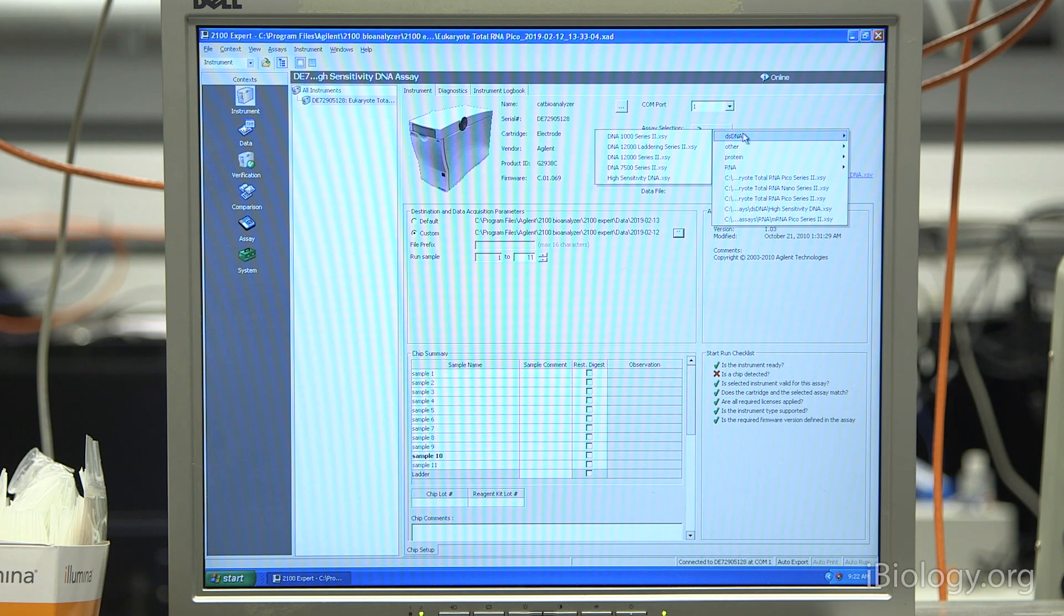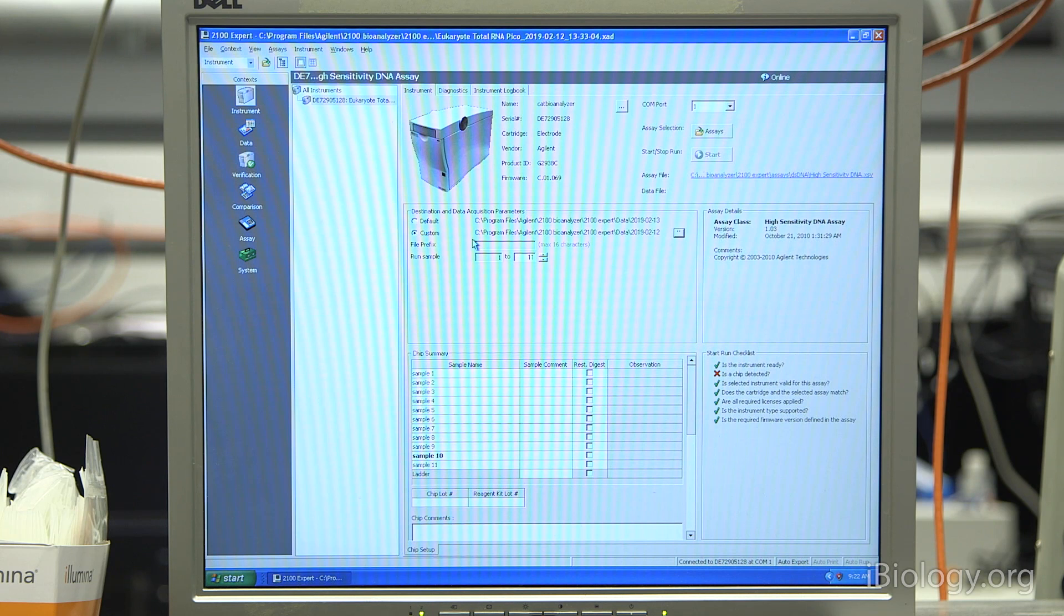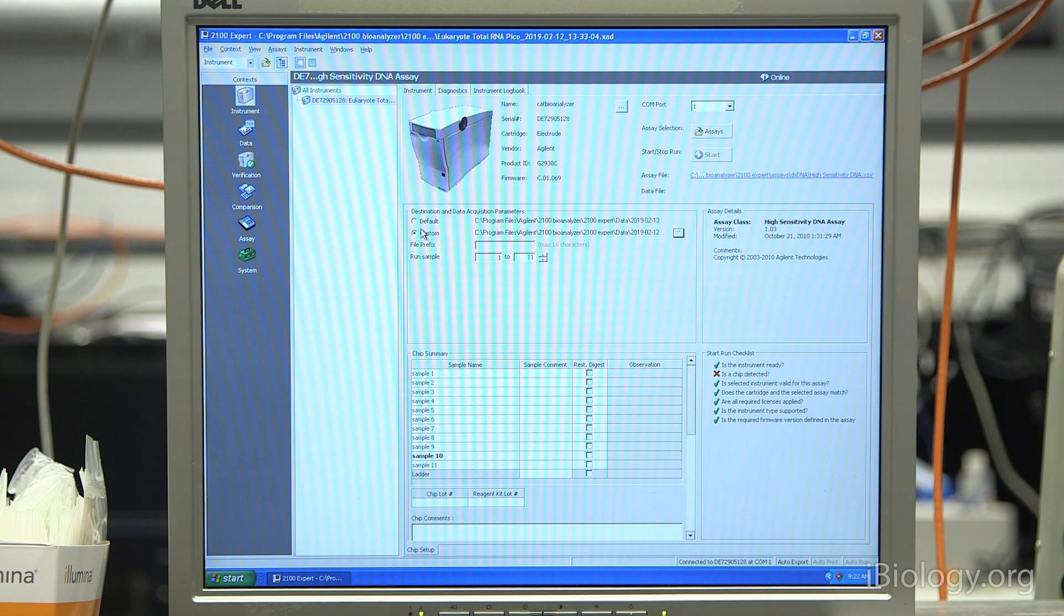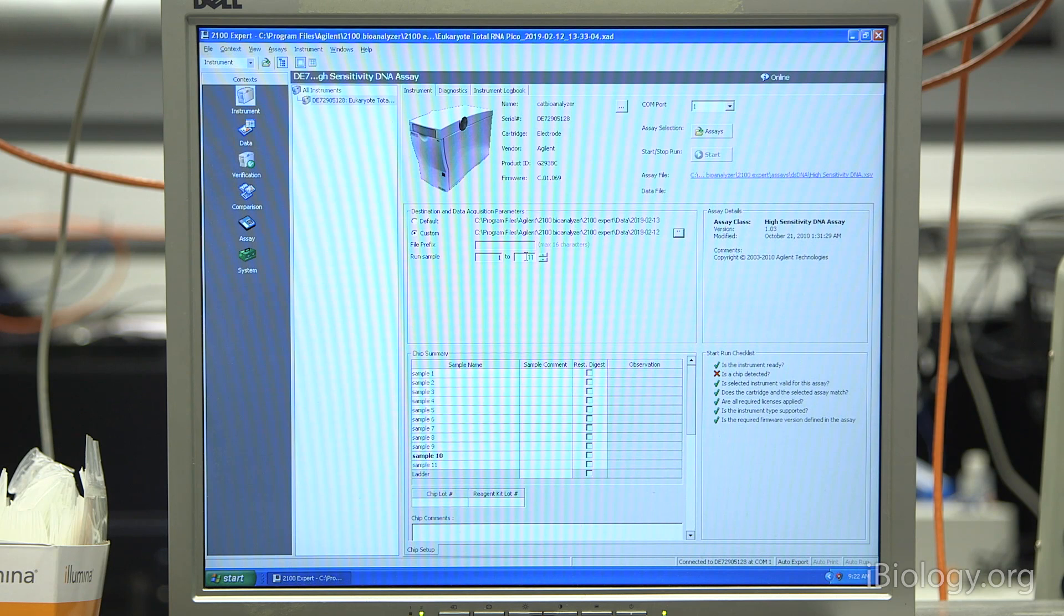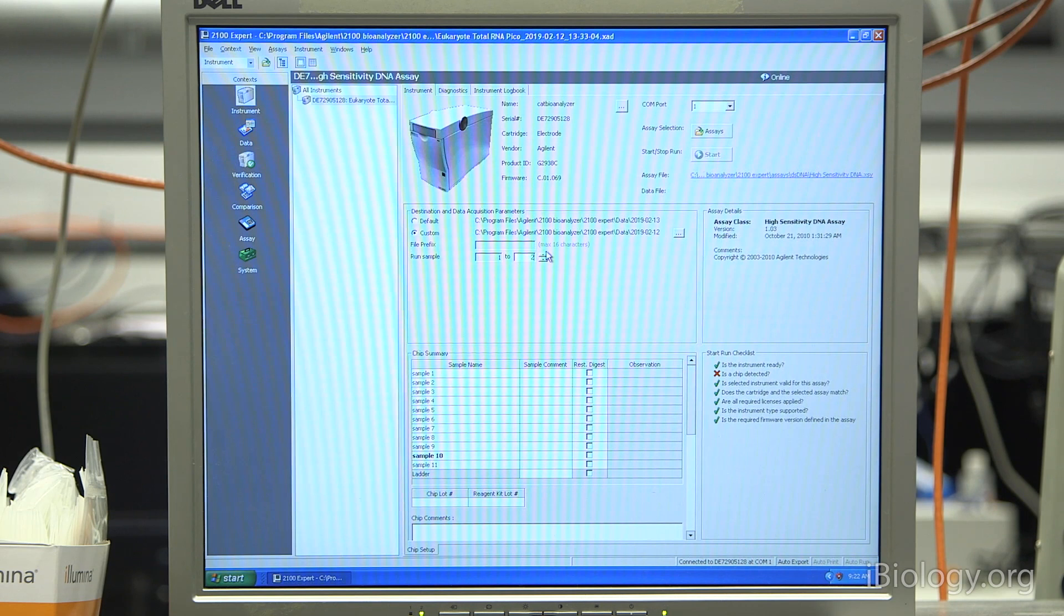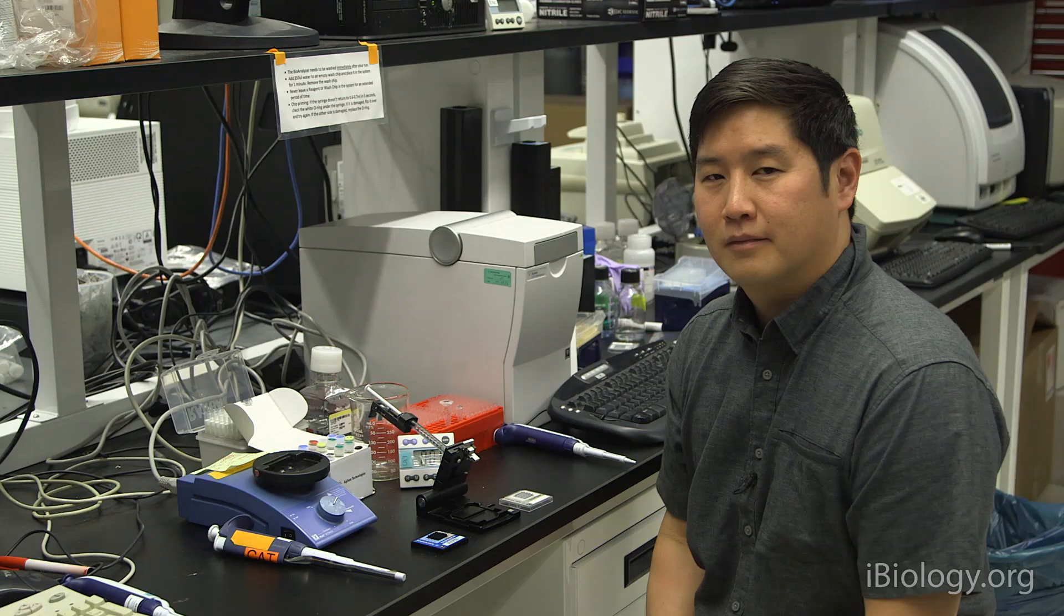Since we're running DNA high-sensitivity, we'll go to double-stranded DNA and select high-sensitivity. Next, you have an option to select where your data gets saved to. It can save into a default folder or a custom folder that you select. After that, let the system know how many samples you'll be running. On the high-sensitivity DNA chip, you can run up to 11 samples. Today, we'll only be running two samples. At the bottom, you can give names of your different samples and label them down here. We'll just use sample A and sample B.